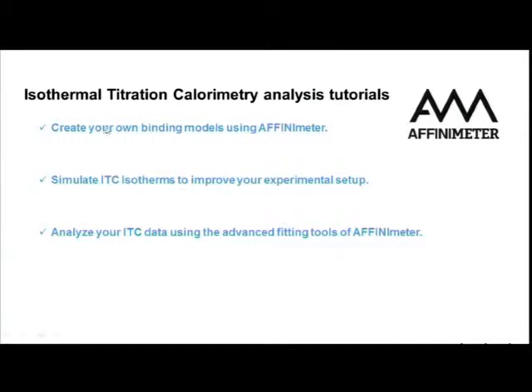I will talk in the first tutorial on how to create your own binding models using AFFINimeter. A second tutorial talking about how to simulate ITC isotherms. And finally, I will talk about how to analyze ITC data using the advanced fitting tools of AFFINimeter.